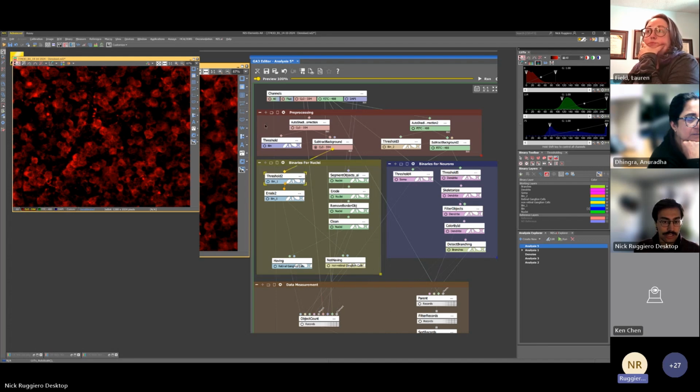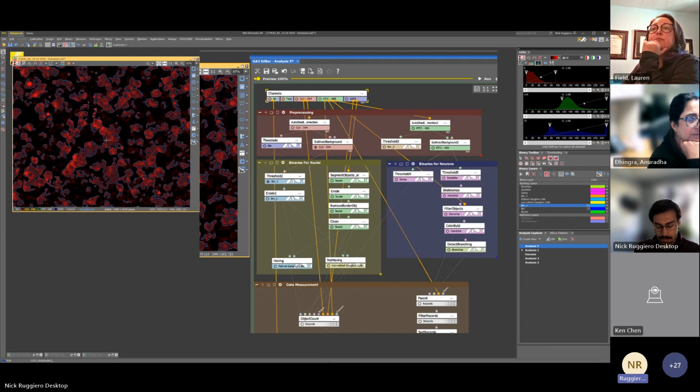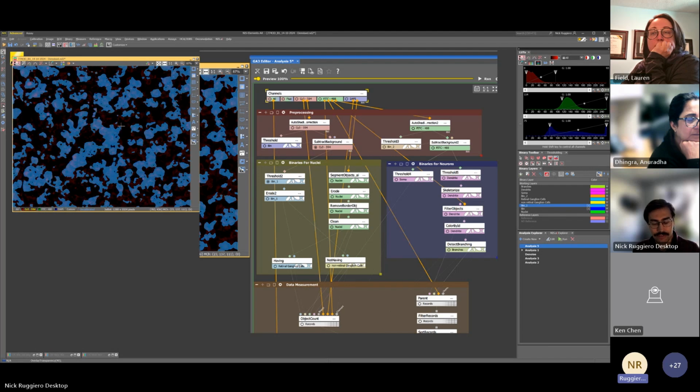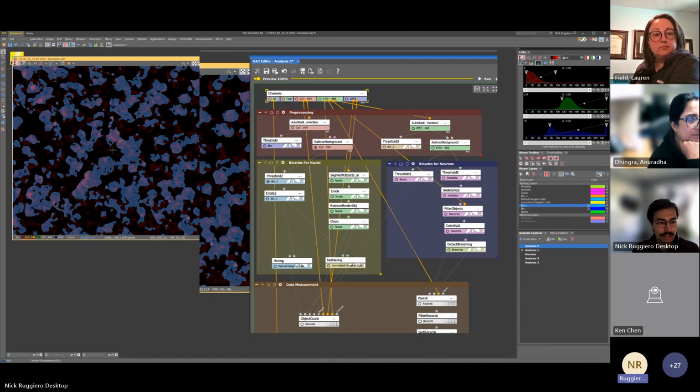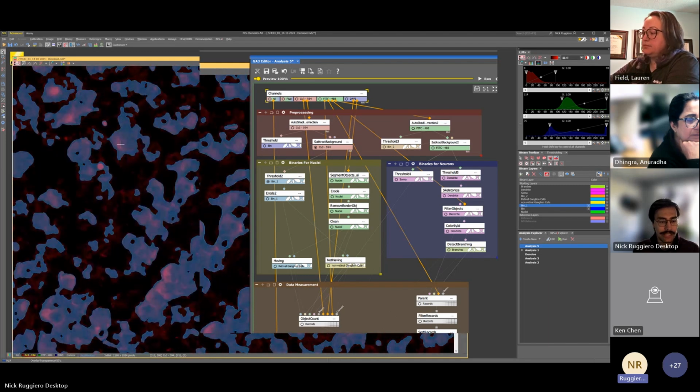It's connected to this background layer. You can connect it to the traditional layers, but it's not going to give you as good results. And this is the threshold that I came up with. Another quick shortcut that you can use, if you hold Control and hit the up arrow key, you can change the opacity of these binaries, which can be useful if you're trying to see what you're doing. I usually keep them at like 20% opacity, just so that I can get a better idea. And again, this is what I thought were the cells of interest.